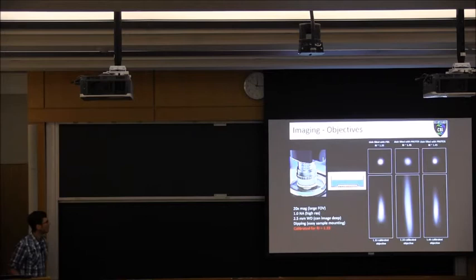But if we switch our objective back to this one, which is actually designed to work in this Protos solution, you now see we go back to a nice tighter point spread function, both in the lateral and axial dimension. So that's why you don't want to do this with a water dipping objective.